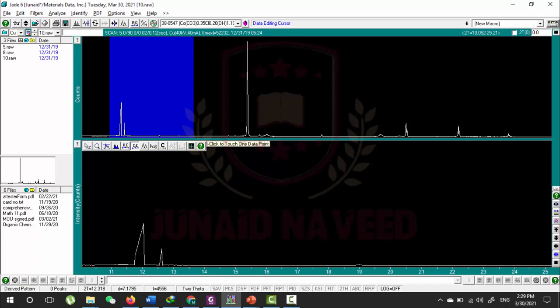If I choose this, it is changing my peaks. You understand what this option is doing. This is not recommended because it will change your original data, which is not good.